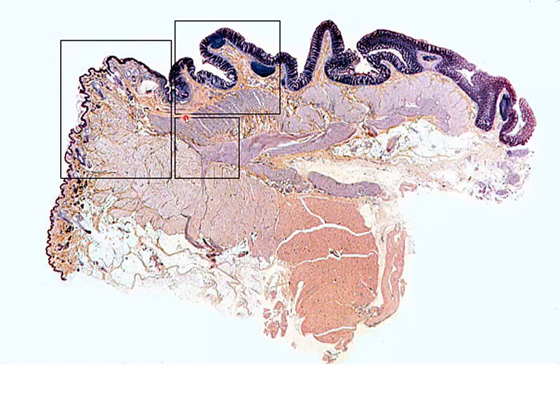And as we get out here to the end, we can see how we transition that mucosa from the rectum at the anus, and this is going to be the surface of our skin that's on our buttocks, and we can see hair follicles and everything we recognize as thin skin. So we know that this is going to be the place where we're going to have this expanded muscle, and this expanded muscle is going to be our anal sphincter that controls the release of our feces.